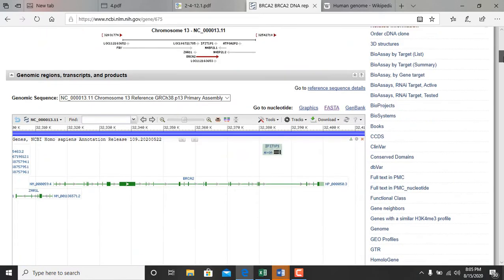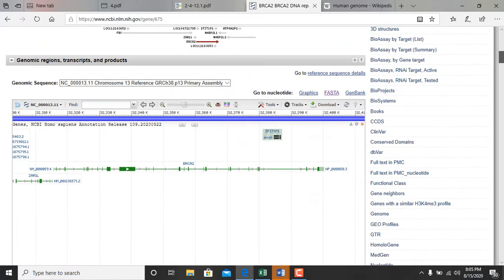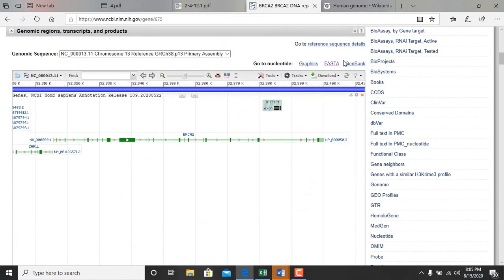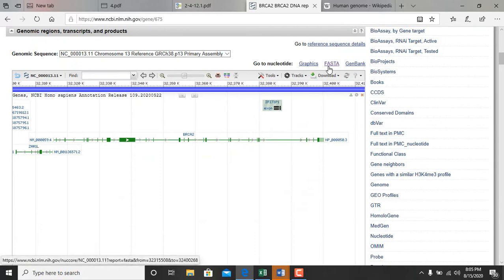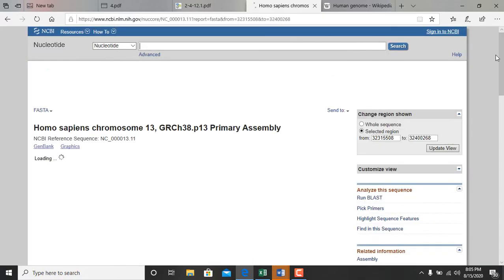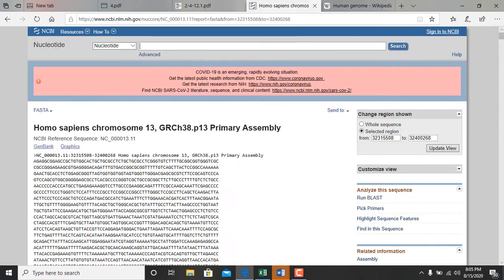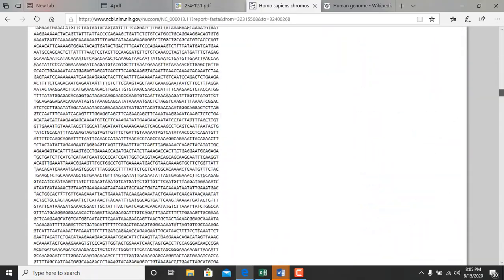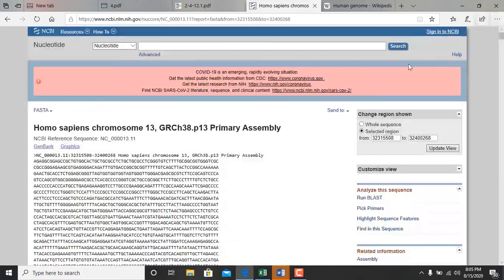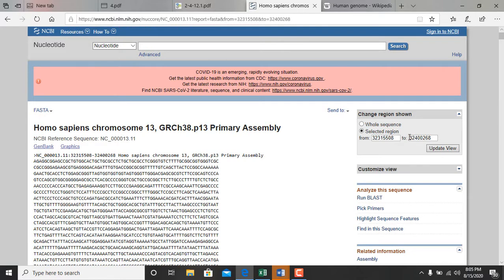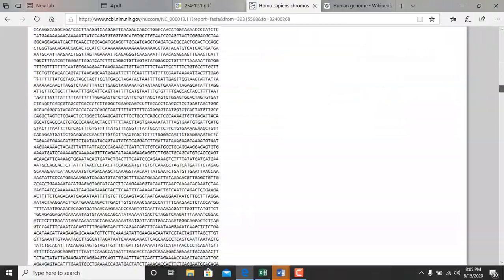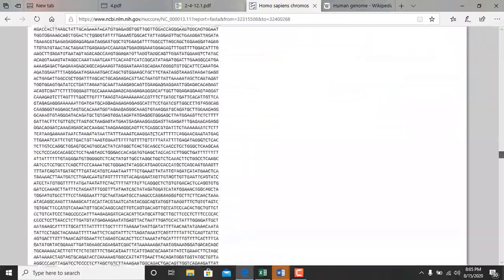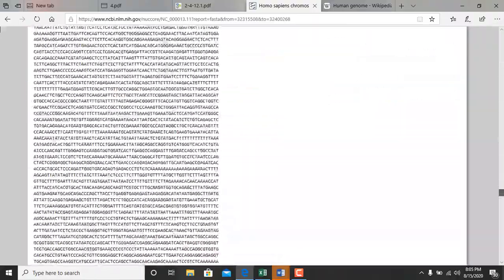If I want to retrieve the sequence of this gene I click on FASTA. This is the sequence of the gene. The sequence of the gene is very large.